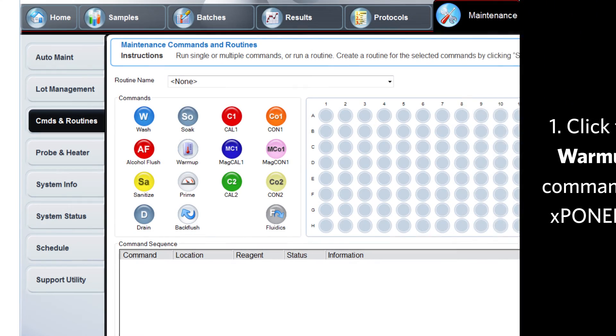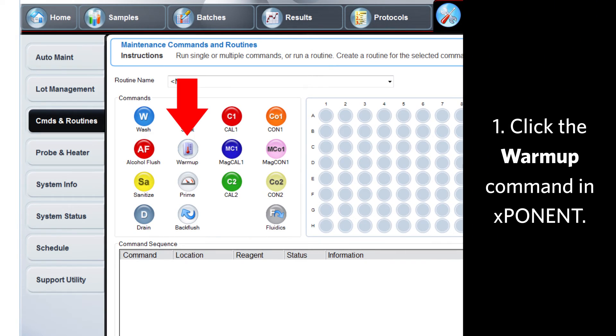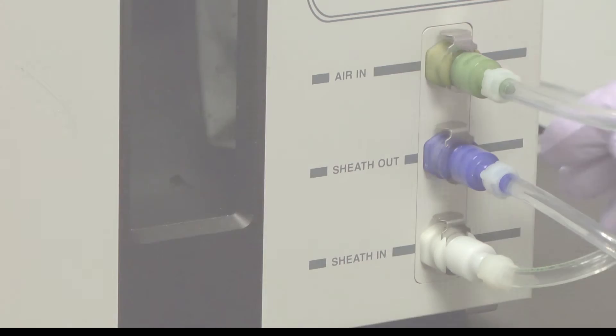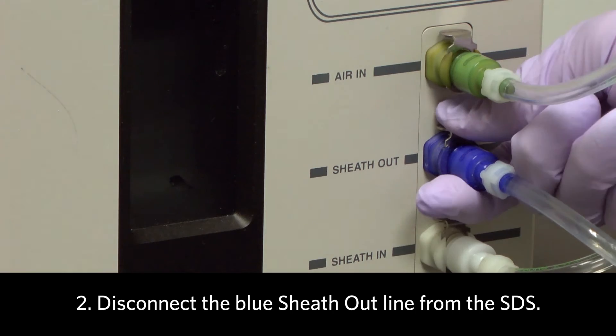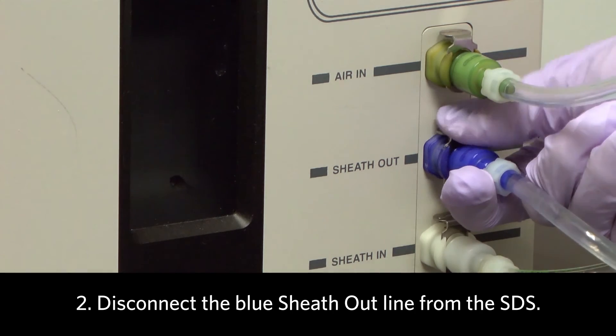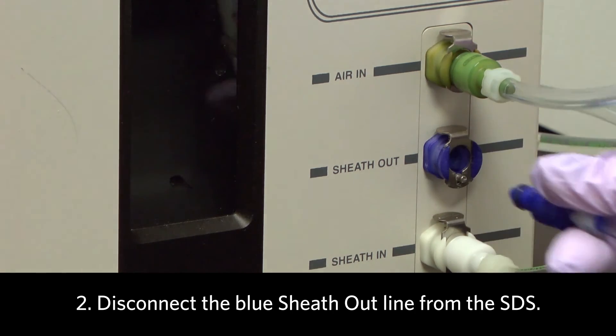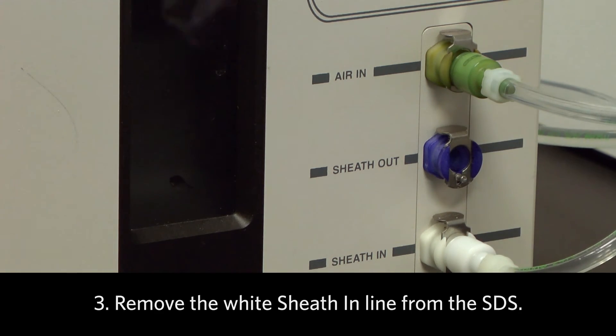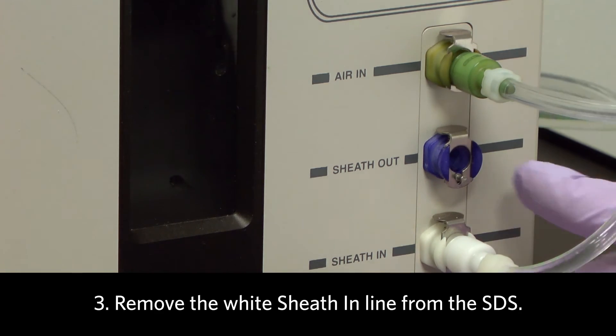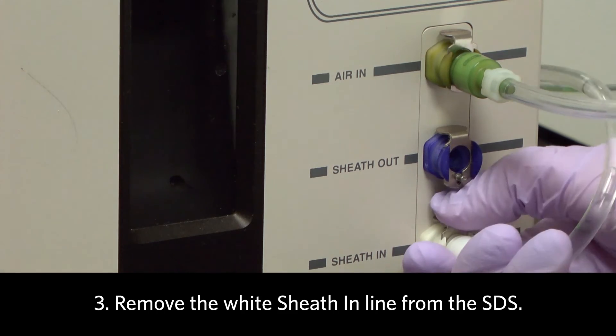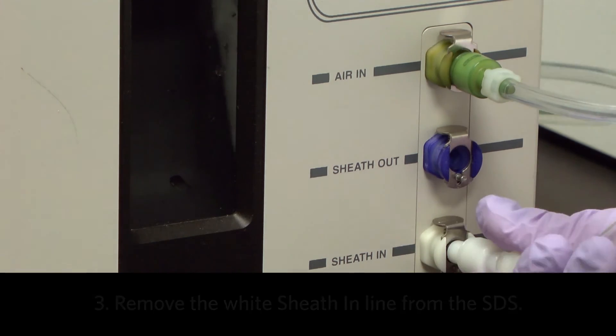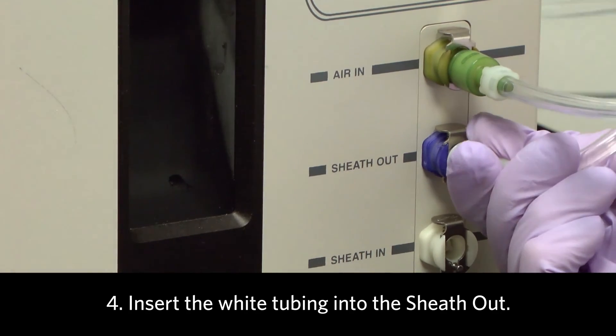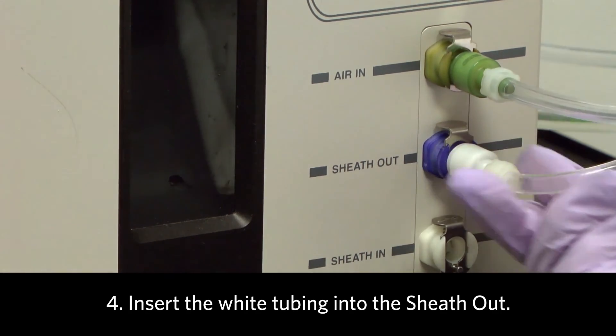First, click the Warm-up command in Exponent. Then disconnect the blue sheath outline from the SDS. Remove the white sheath-in line from the SDS. Insert the white tubing into the sheath out.